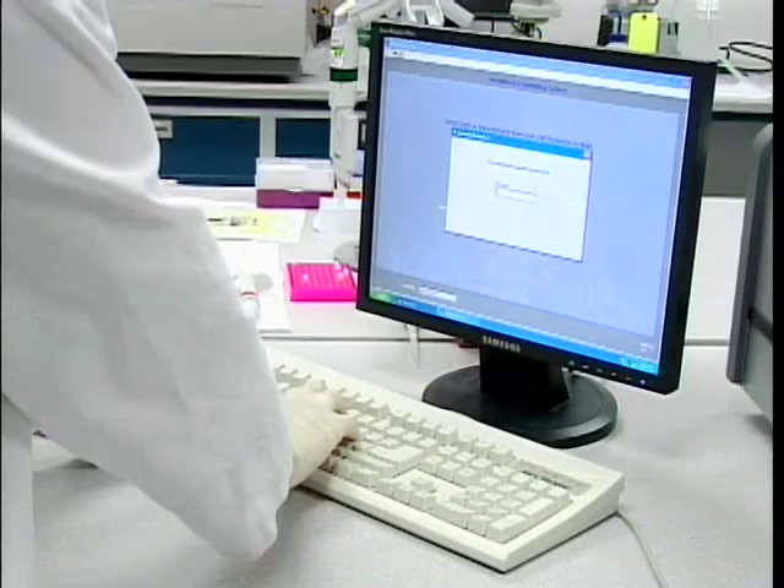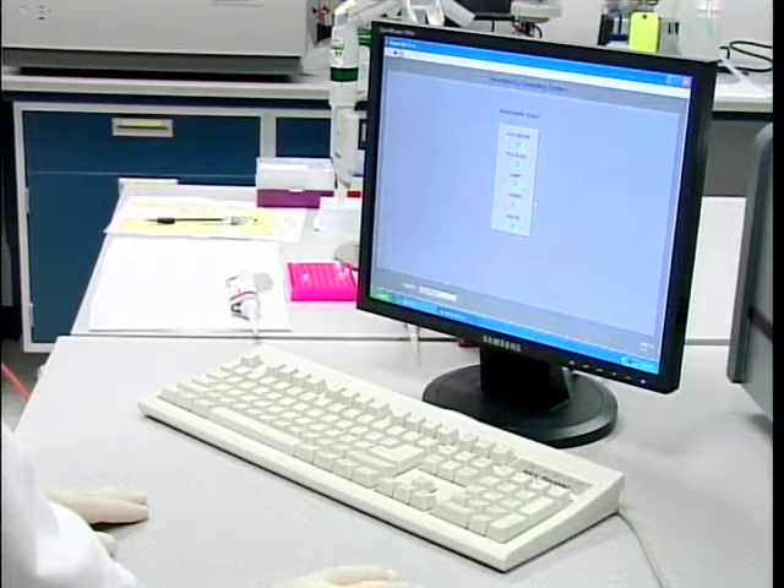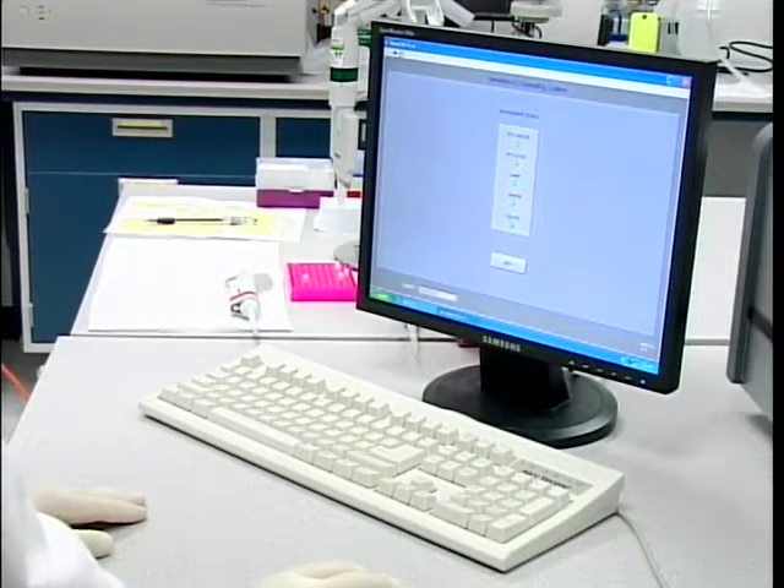The operating software for GeneBench FX Series 100 requires you to log in before initiating. A password is set up and the instrument status is checked — each of the controller boards, the heater, the laser, and the high voltage power supply.